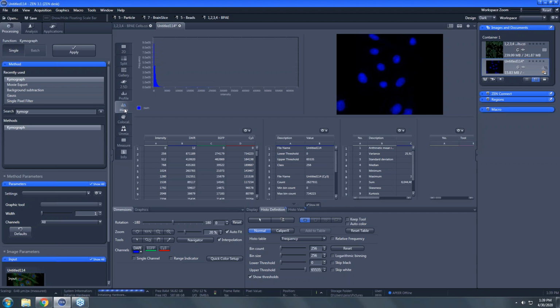In the top left is a plot of the frequency of each intensity, so it's a basic histogram. Just below that, on the far left, is the data table with the frequency data instead of the plot. So the plot and the data go hand in hand. And then we have a number of statistic windows, and some measurements which are empty currently.